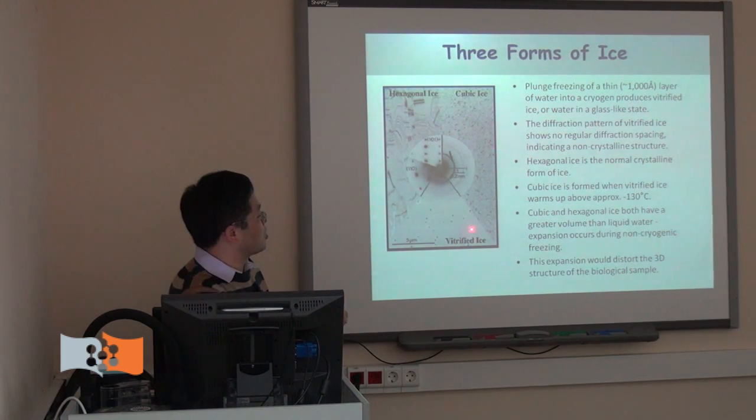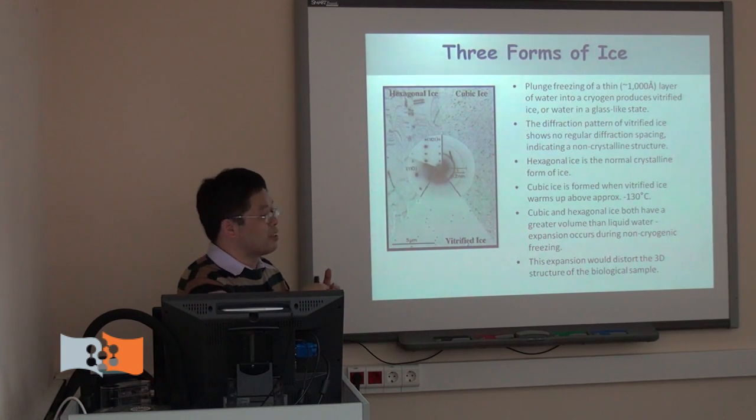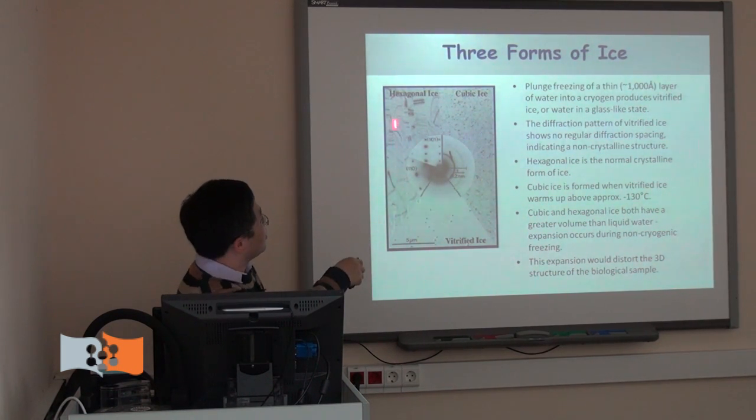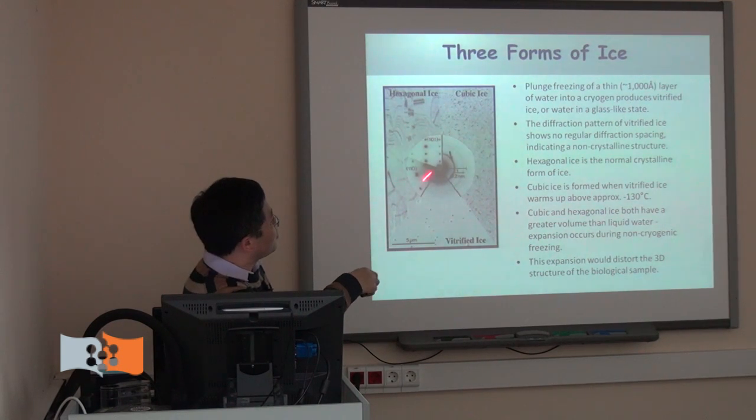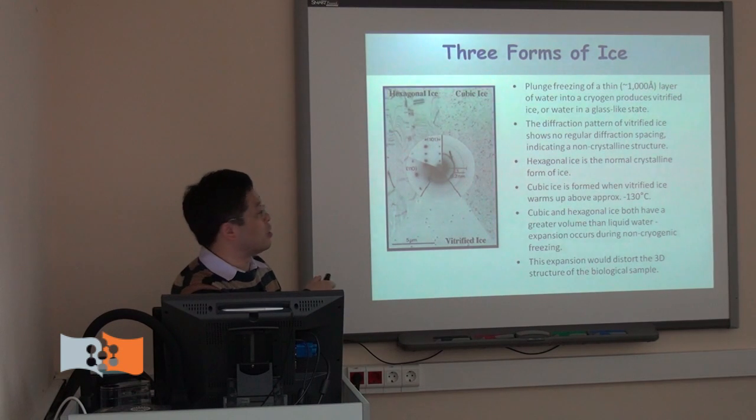There are no crystals. If you use diffraction mode, there is no periodicity, no dots. But if the ice is too thick, or the speed of the cooling down is not fast enough, you will get this kind of crystallized ice. This is not good for our EM study.